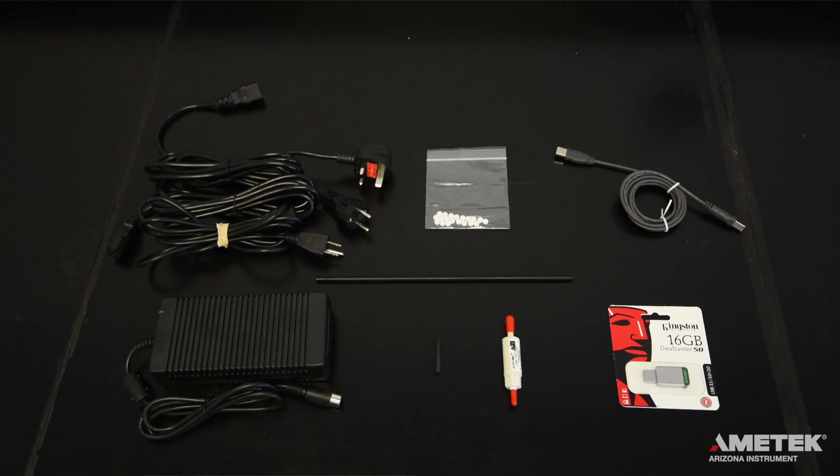If you have purchased the J605 with the communications package, you will also receive a six-foot type A to B USB cable as well as a USB flash drive. If you are missing any of these items or have questions about these or any other parts and accessories you may have received, please contact Ametek Arizona Instrument or your local representative for assistance.